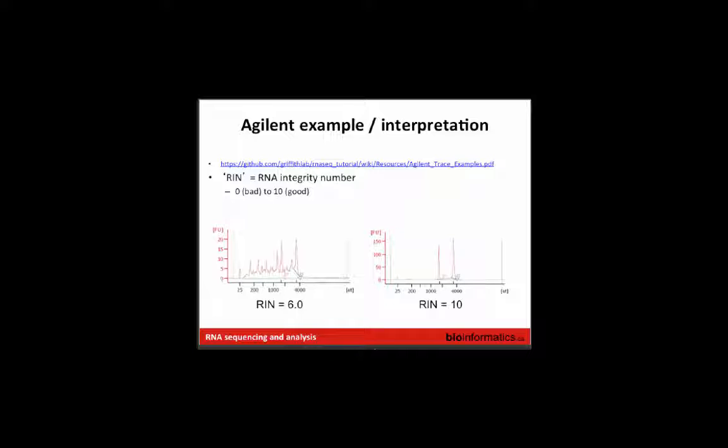It's really the most effective way at removing the ribosomal RNAs. There are a lot of other strategies that work okay. You do wind up having to sequence a bit deeper, so it's sort of a cost consideration.